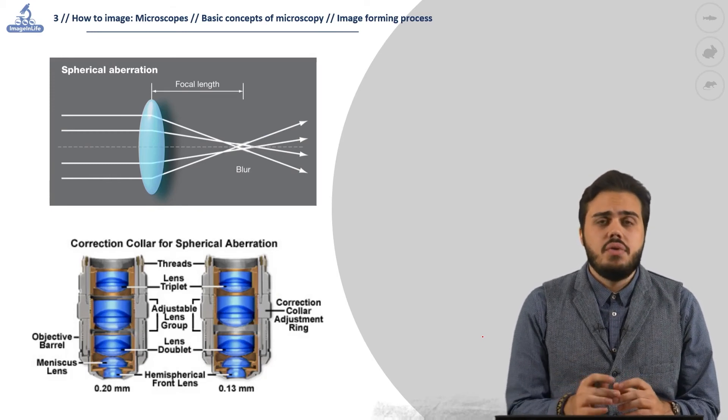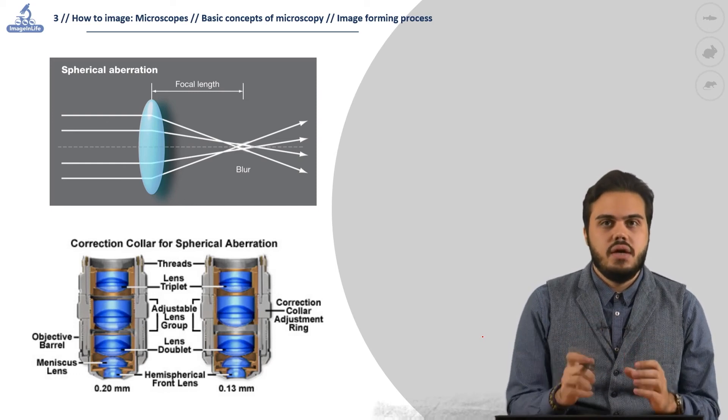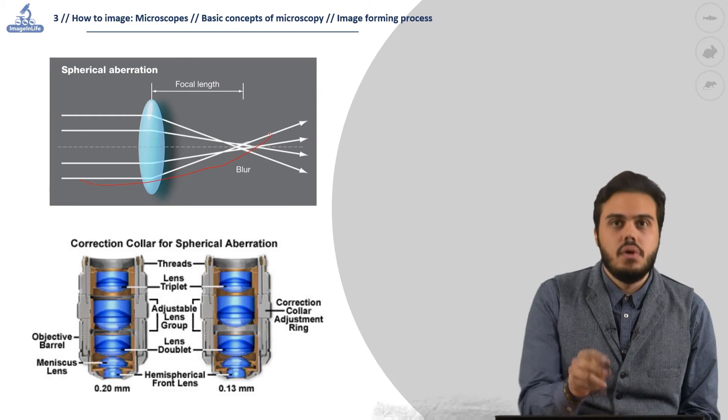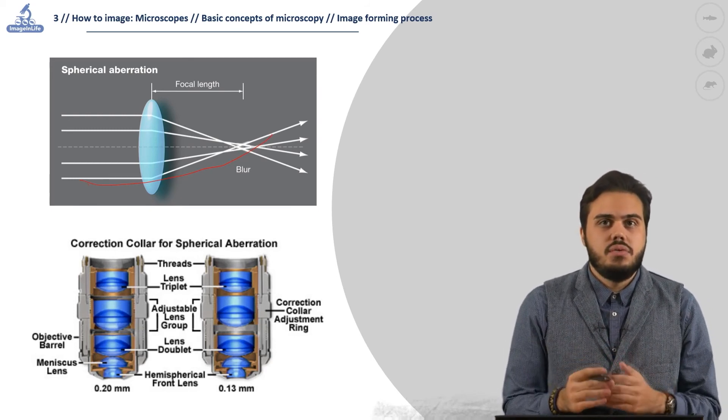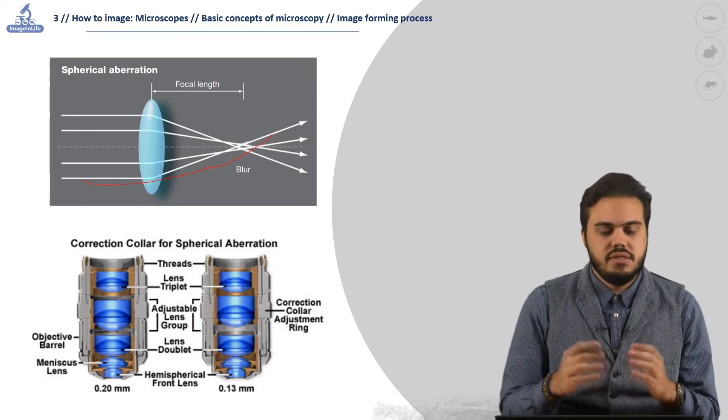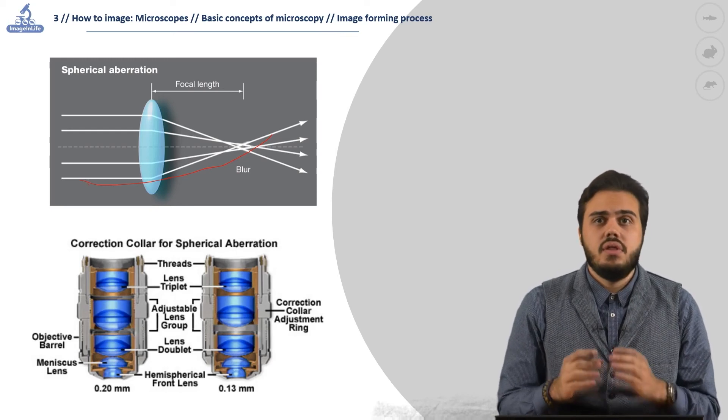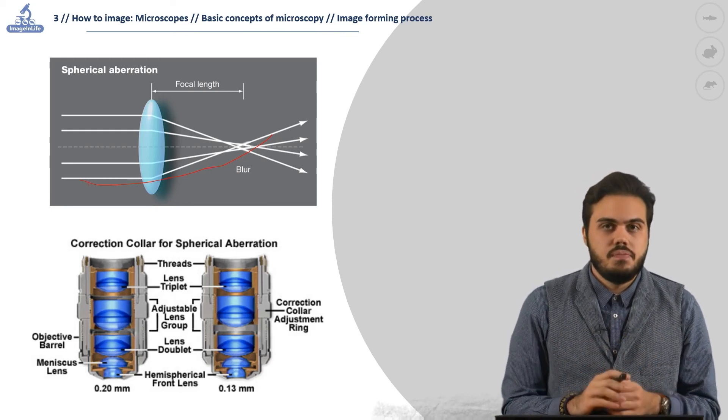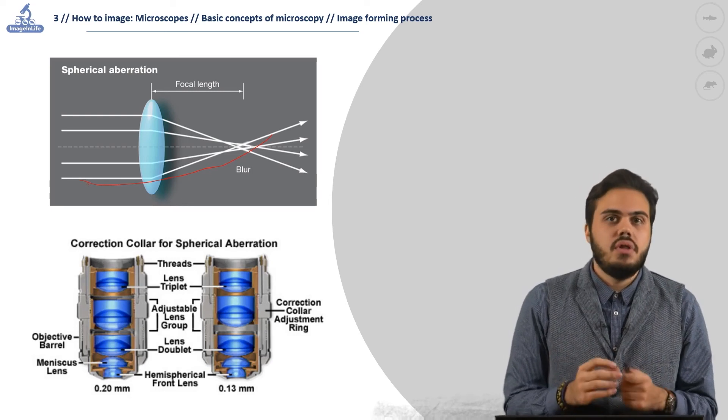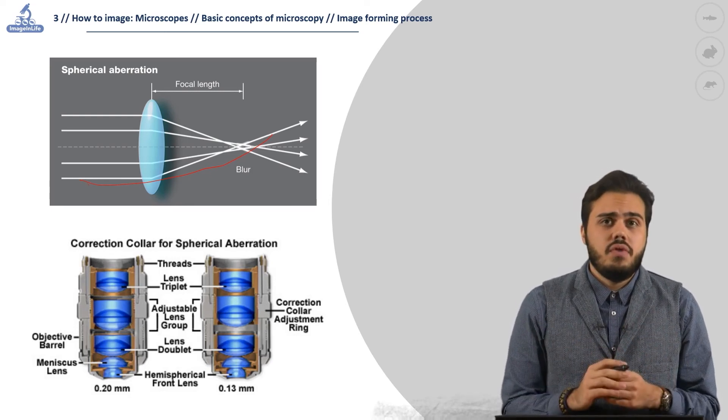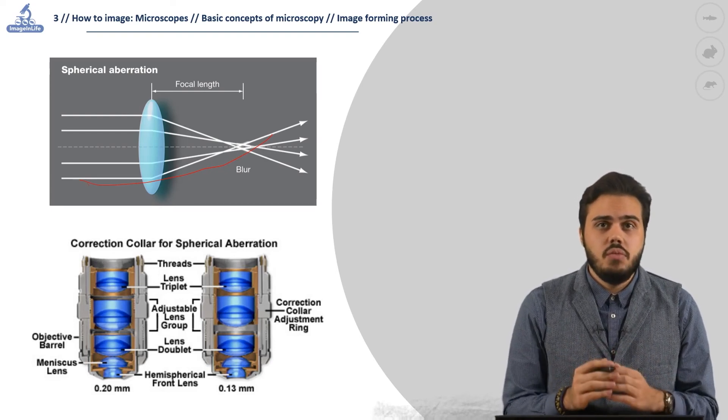The spherical aberration is caused by the difference of paths taken by diffracted lights. The peripheral lights and axial rays have different focal points created by the shape of the lens itself. These different focal points blur and impact negatively the contrast in the image. There are several approaches to resolve this problem and often they are combined. Often in the objective are incorporated series of doublets and triplets to reduce to the minimum the aberration.